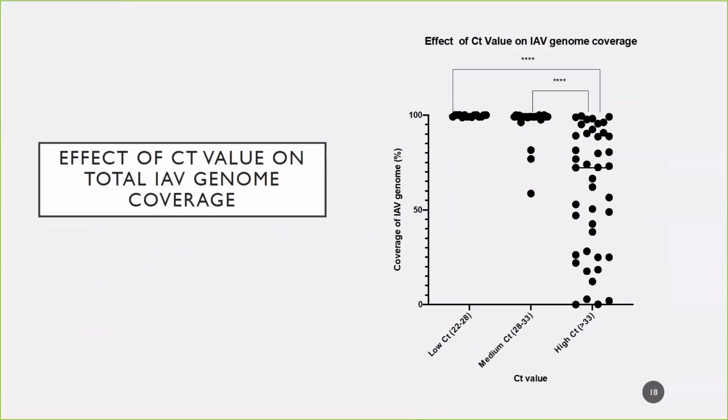On this graph, along the y-axis, you're looking at the coverage of the influenza genome as a percentage, and along the x-axis, you're looking at the samples based on their CT value. The oral fluids typically had lower CTs in the 20s range, whereas the environmental samples, the air and swabs, typically had CT values in the last group, the higher CT values. For this group, the coverage of the genome is a lot more variable, and again, this is what we see with the air samples and the environmental swabs. Next slide.